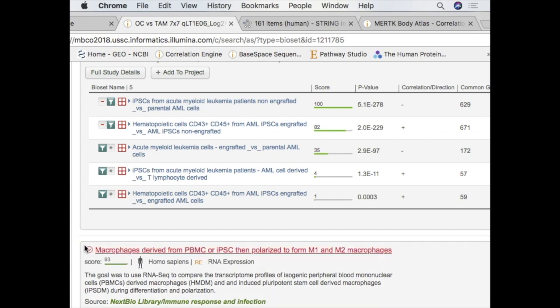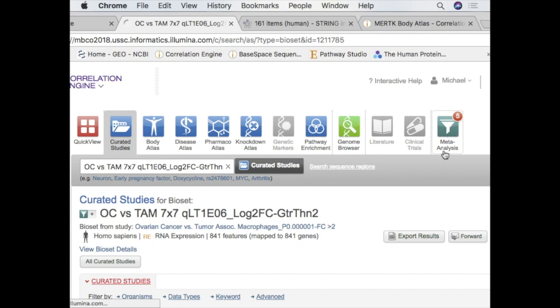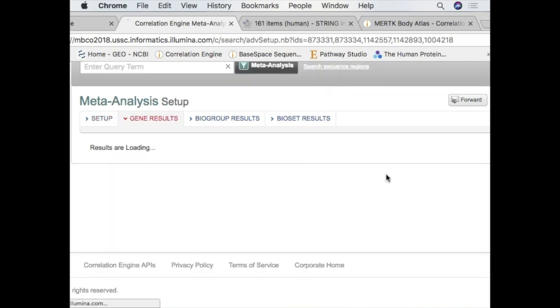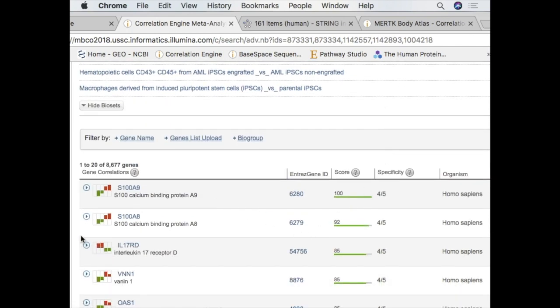get as many studies as I want, and then at the very end, what I do is go to this meta-analysis. It's got all the genes of my studies. Now I can see what all the genes do in those. Right? And what's really cool is, I just kind of picked them haphazardly. But say I was working on papillary renal cell carcinoma, and I had like 8 different studies and 17 different lists in those studies, and they'd all be green or red. I mean, the consistency is amazing.